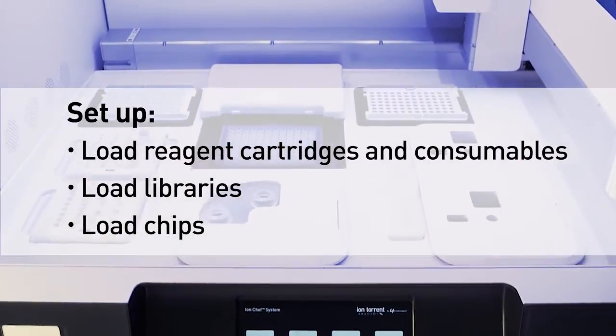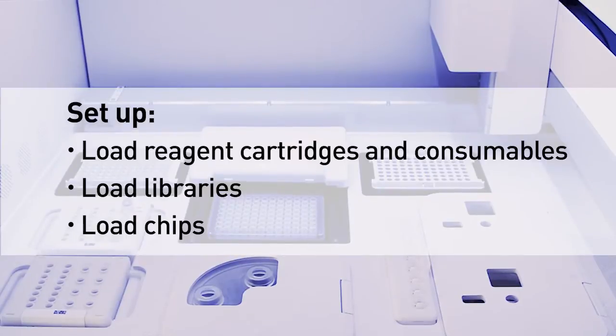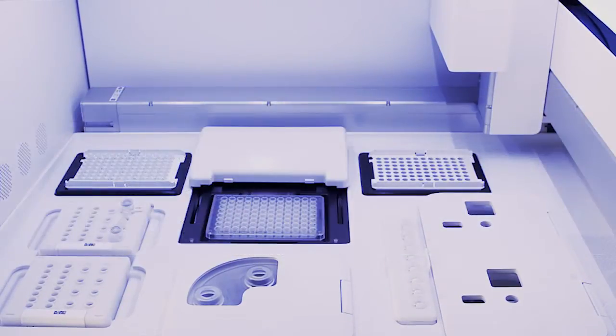The Ion Chef system typically takes less than 15 minutes to set up. The steps are very simple and can be easily performed by users of any skill level. The Ion Chef system starts with libraries and automates template preparation all the way to chip loading.